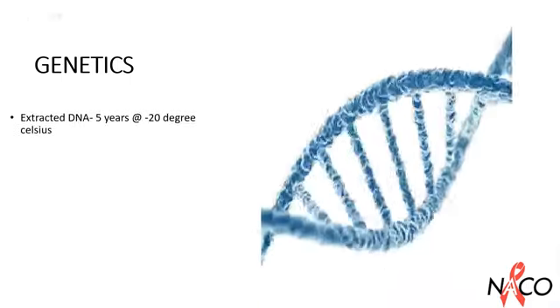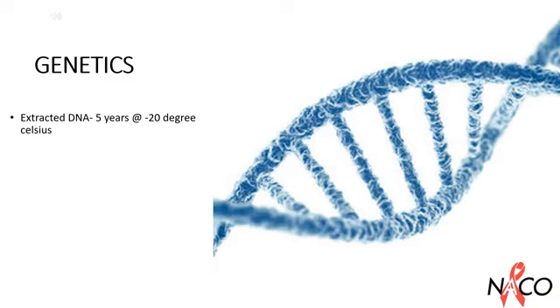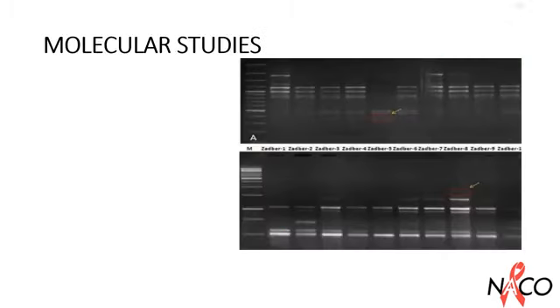Extracted DNA should be kept at -20 degrees Celsius for 5 years. Extracted RNA should be kept at -70 degrees Celsius for 5 years. Section: Molecular Studies. Molecular diagnostic gel pictures should be retained for 5 years.